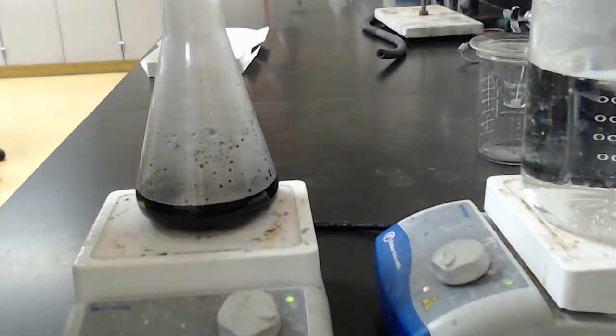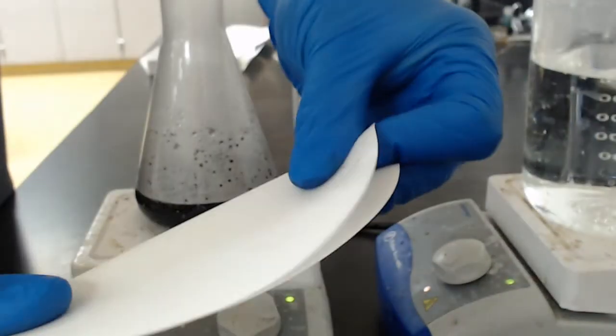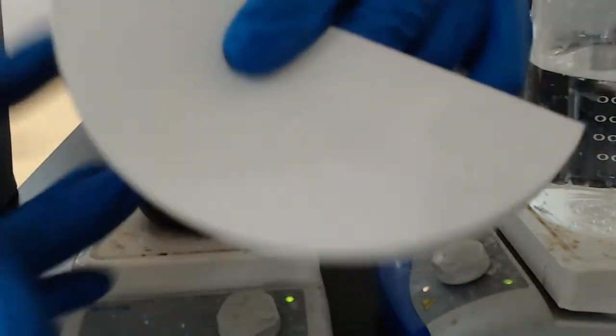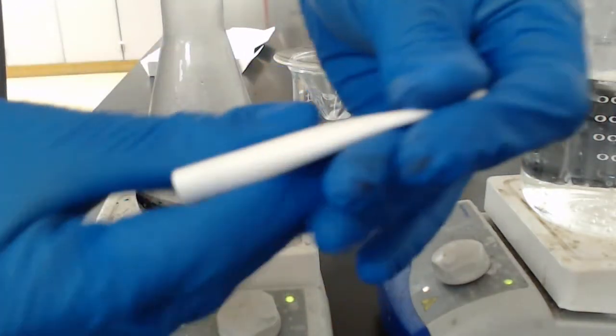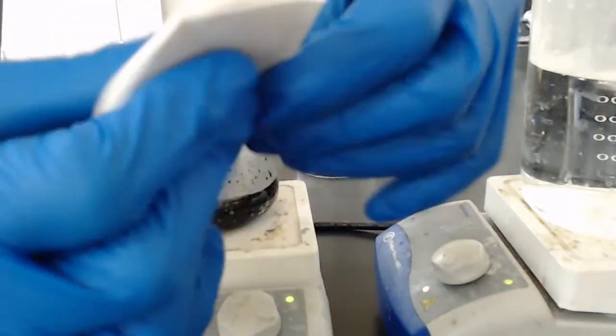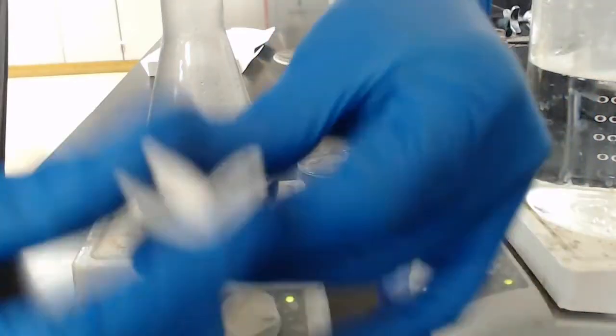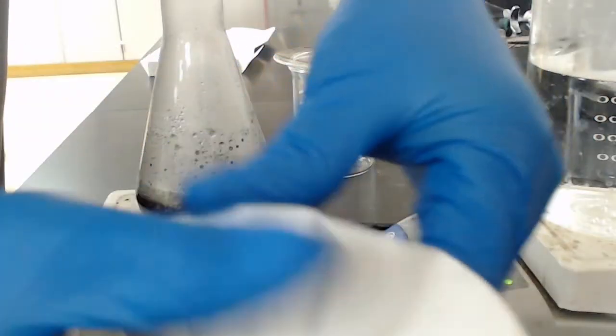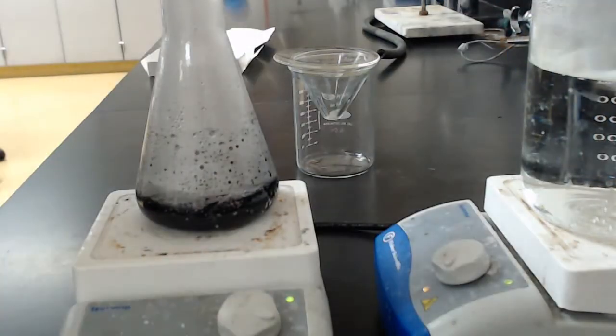Okay. At this point, we want to do a hot filtration. Meaning that we're going to keep it hot during the whole process. But first things first, I need some filter paper. Filter paper. Go ahead and fold it in half. And we're going to flute it. So we have to fold it a couple times. I fold it in half. And then I just keep folding in half until I can't fold it in half anymore. And there's actually a physical limit on how many times you can fold a piece of paper in half. I think it's eight. Eight or nine. Doesn't matter how big the paper is. All right. So your liquid will flow a lot better if it is fluted like this. So it's kind of like a coffee filter at this point.